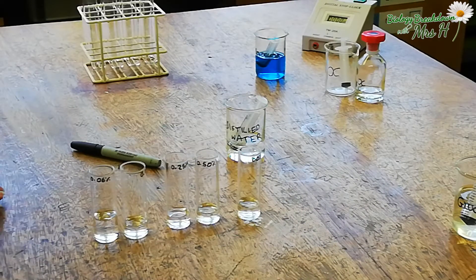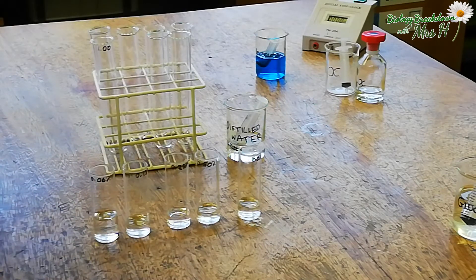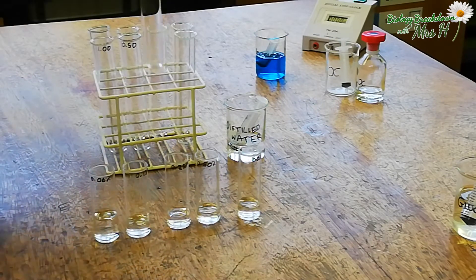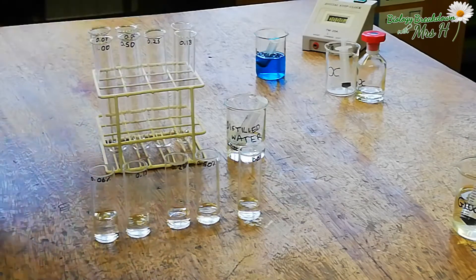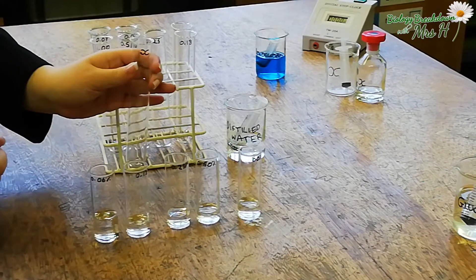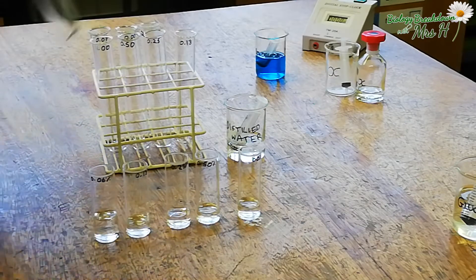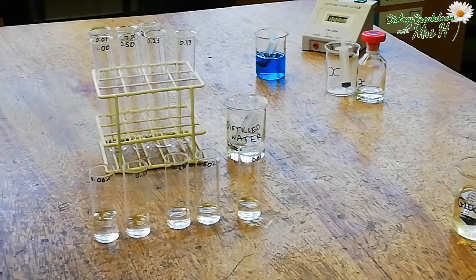Next you need to label five boiling tubes with the same concentrations, but you will also have an extra tube for an unknown solution which we'll label X, and distilled water. The distilled water will be your 0.00% glucose solution, so you should have a total of seven boiling tubes.